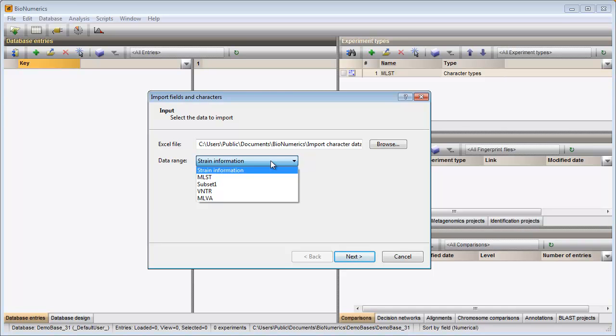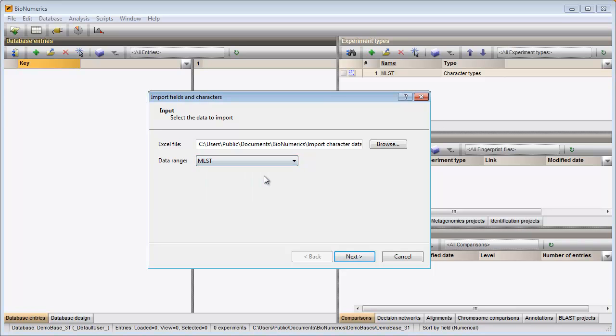All sheets are displayed in the drop-down list. If named ranges are saved with the Excel file, they are listed here as well. Since I want to import all information from the MLST sheet, I select the sheet from the list and press Next.